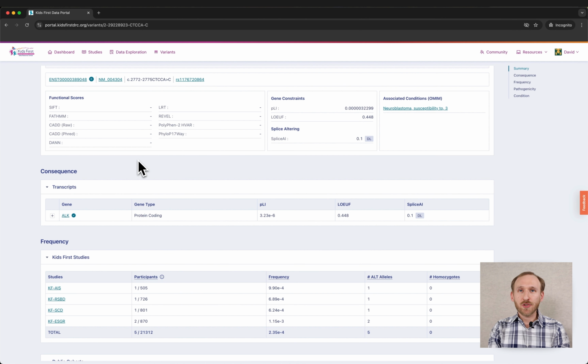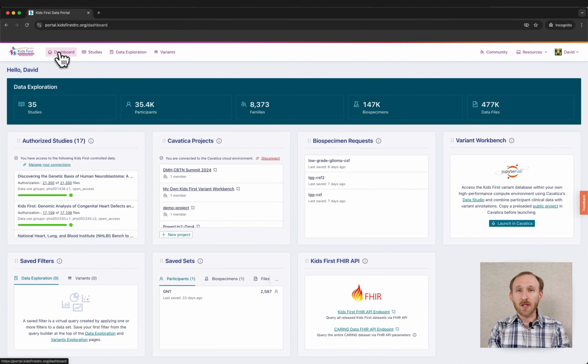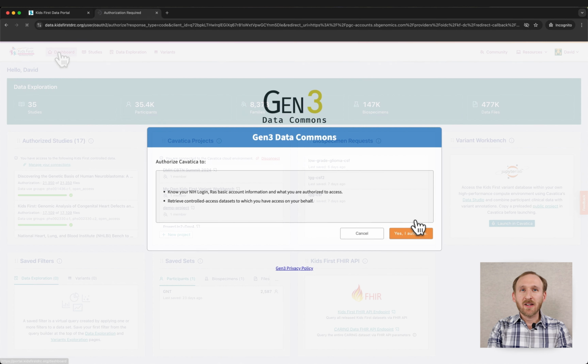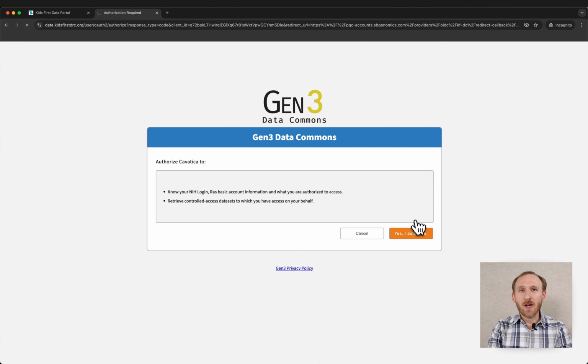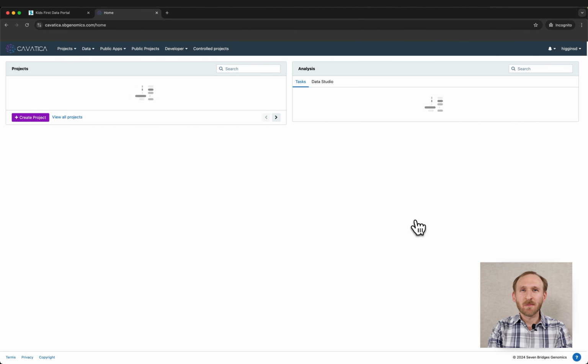If you've already received controlled access to the list of studies, then we can go deeper and use the Variant Workbench tool to identify more information about each of the participants. If you don't have access to any of the Kids First studies you'd like to explore, check out the second video in our user support playlist on how to request access to data through dbGaP. To access the Variant Workbench, you'll navigate to CAVATICA and authenticate with an ERA Commons account. You can access the Variant Workbench under CAVATICA's public projects, which you can find in the main nav drop-down menus at the top of the screen.